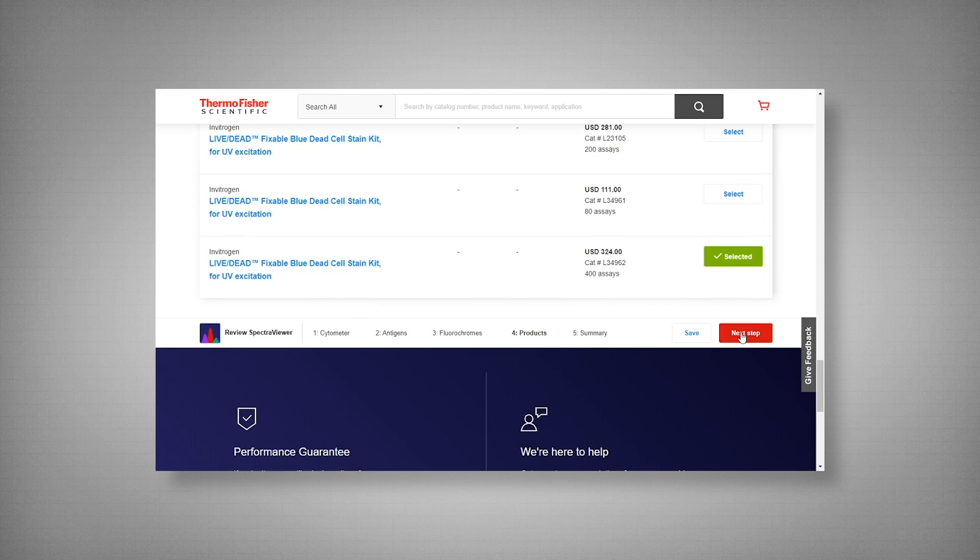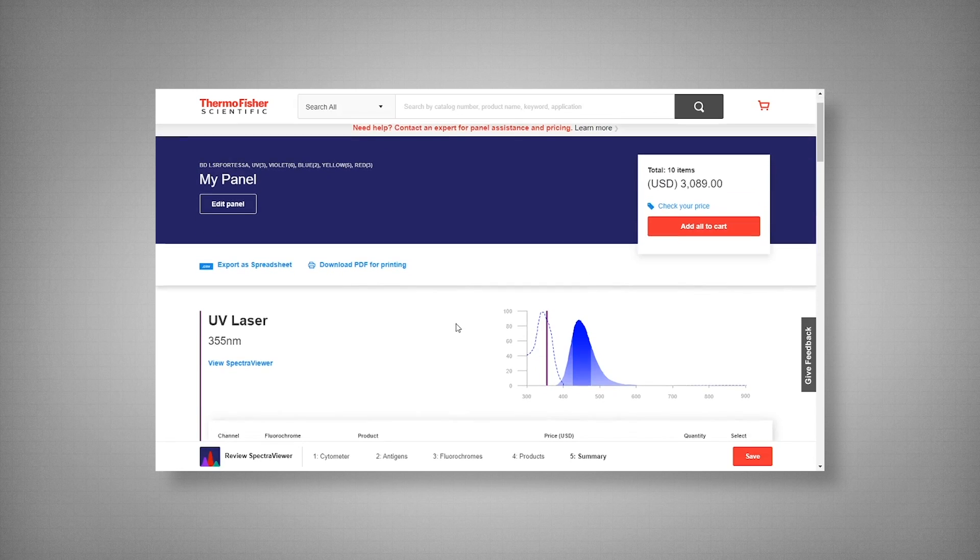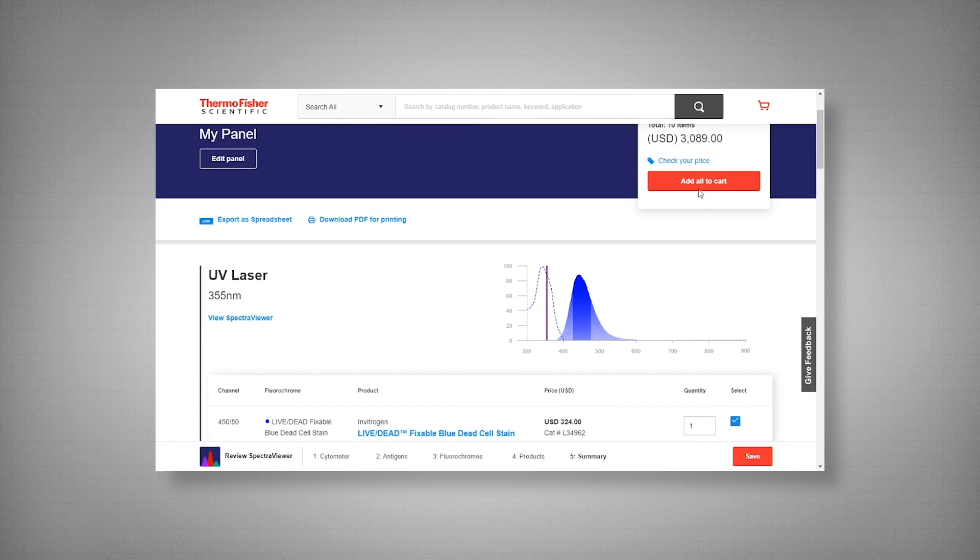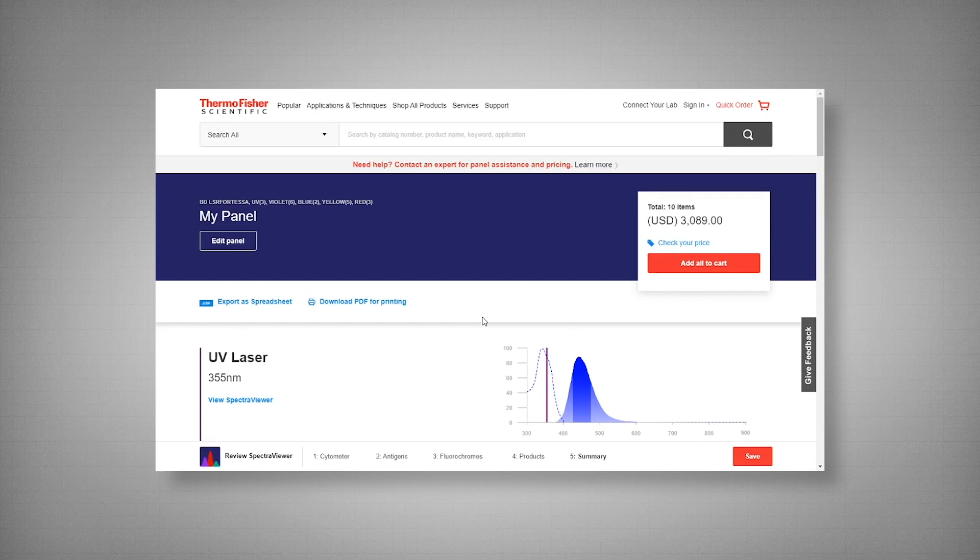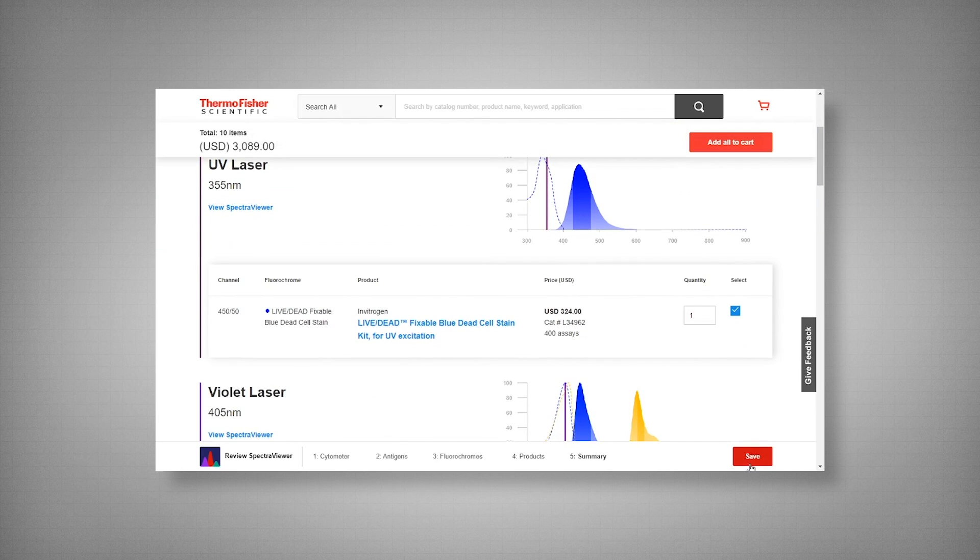And now our final step. Now that we've picked all of our clones, you have your cart. Now you can either purchase your antibodies or you can export your selections into a spreadsheet or a PDF. And you can also save your panel.